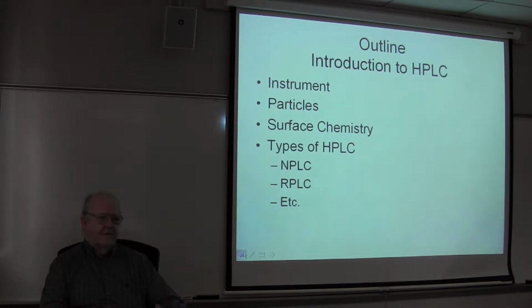But LCs, there's a wide range in properties, and you need to be familiar with them so that you can pick out the appropriate instrument when you have some money to spend and to solve a problem. You need to know the important characteristics of the LC and how it works. So we're going to return to where we left off last time in terms of instrumentation.